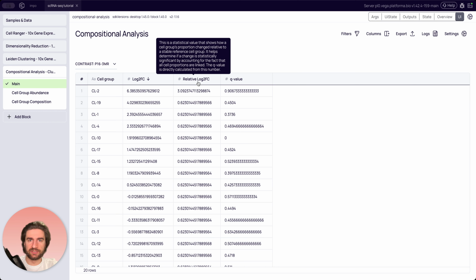But essentially, that is not because these other clusters increased in size. It's just the two that we were looking at, they decreased in the number of cells so much that now we kind of see that all the other ones increased, which is not the case.